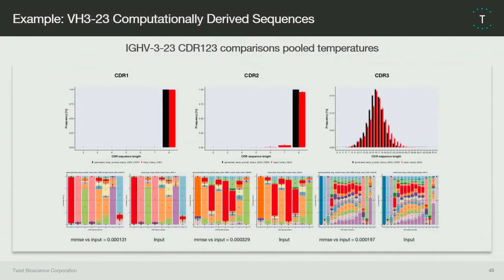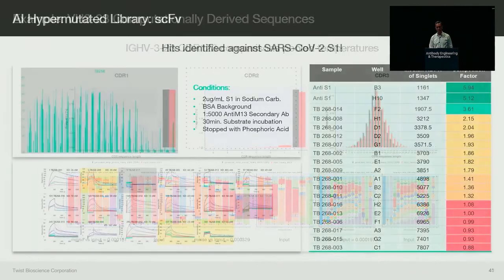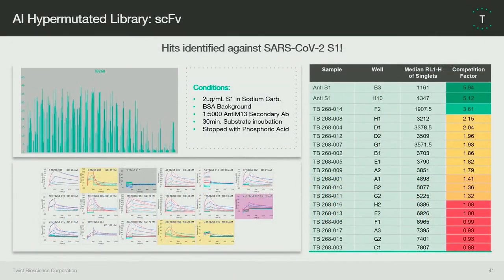We also showed that the final library that was built had very similar allowed amino acids that were similar to the original design set. And as a result, we believe it's a nice survey of sequences that are, again, fully human-derived. And similar to the previous libraries, we pan and screened the library against SARS-CoV-2 and found a whole range of sequences that bound with high affinity as well as blocked the spike ACE2 interaction.